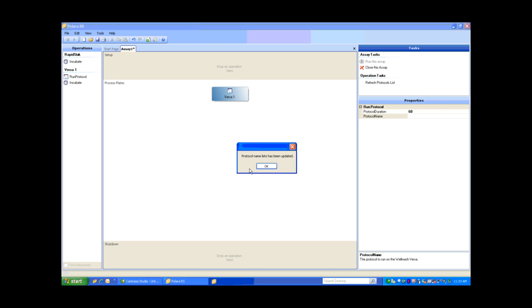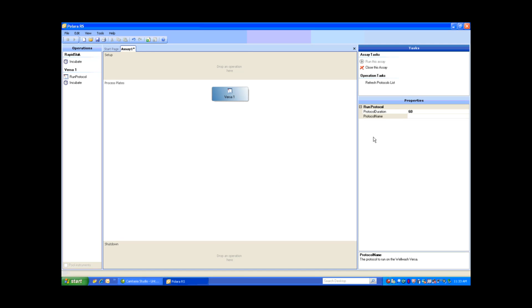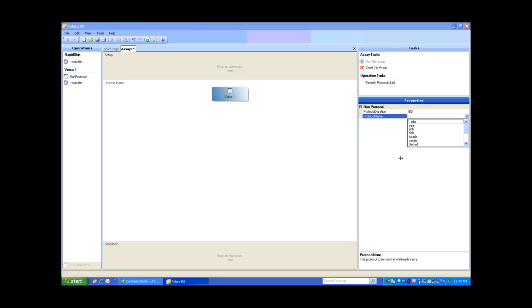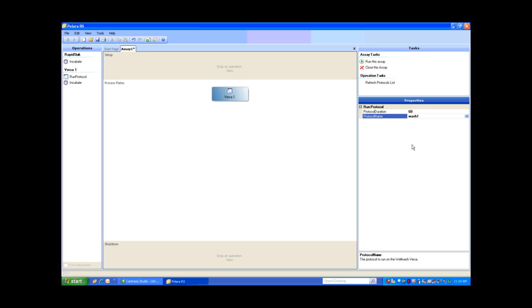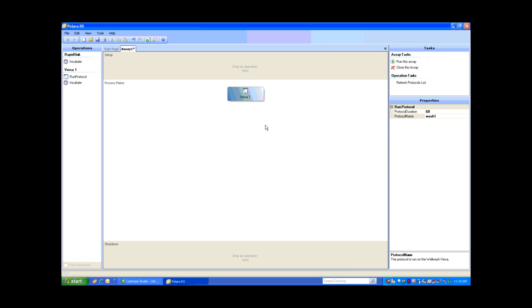The Protocol Name List has been updated, so I'll select OK. Going back to my Protocol Name, you can see it has pulled through all the processes stored on my WellWash Versa. I'm going to select Protocol Wash 1.